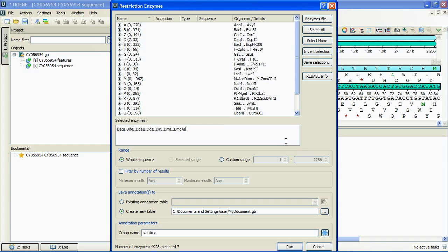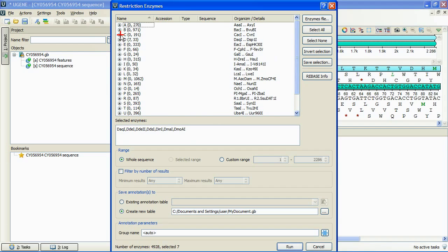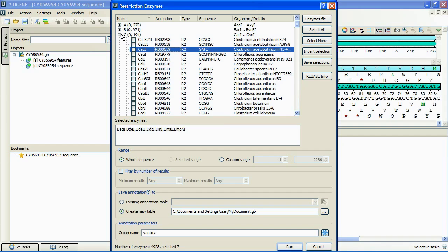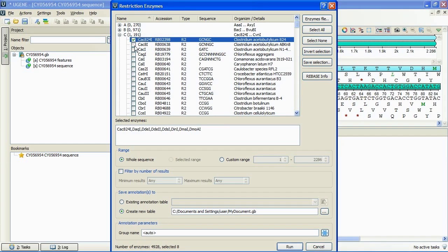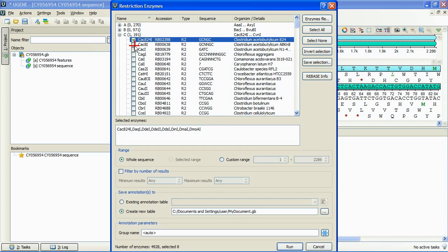The opened enzymes are represented at this table. Here we can unfold an enzyme group, see the detailed information of the enzymes, and select the enzymes to search for by checking their checkboxes.